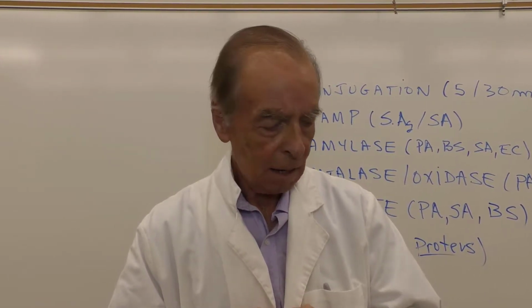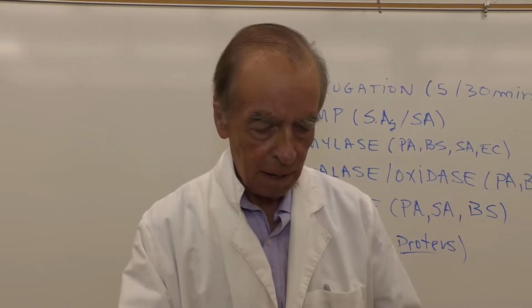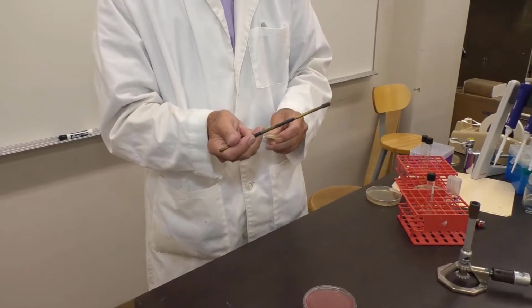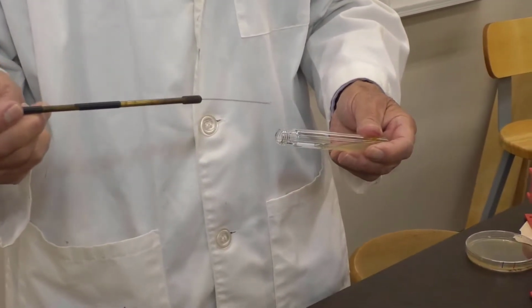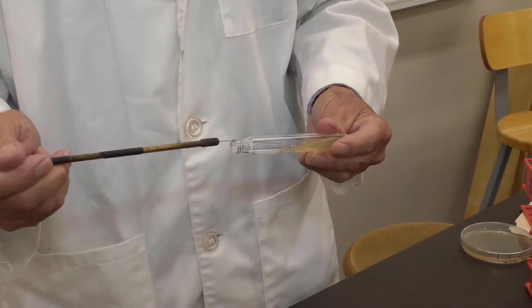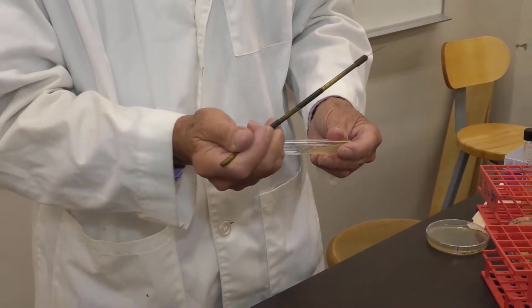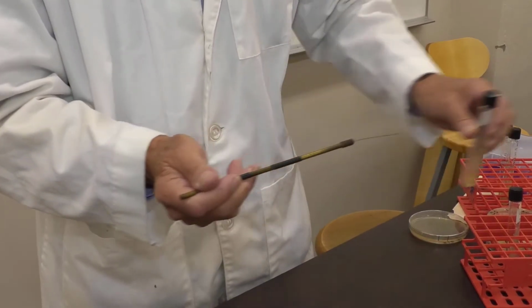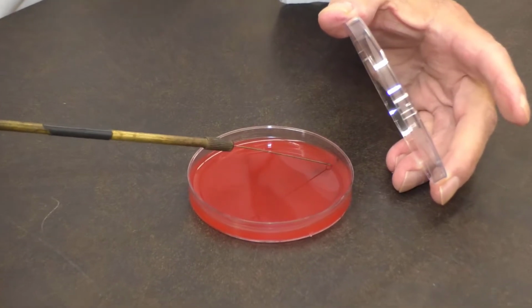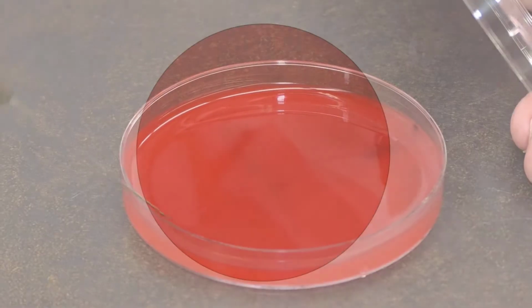So let's first inoculate the plate with Strep agalactiae. It's a blood agar plate. Okay, now in a clinical situation, instead of Strep agalactiae, this would be a pregnant woman's vaginal swab, because we want to test for... single streak down the center. In our case, it's a known culture of Strep agalactiae.